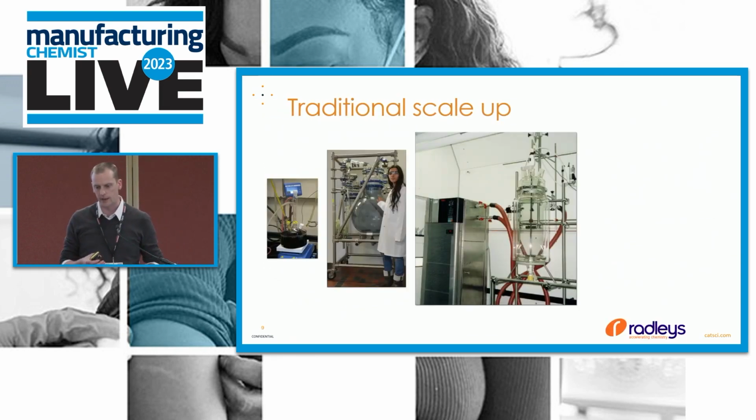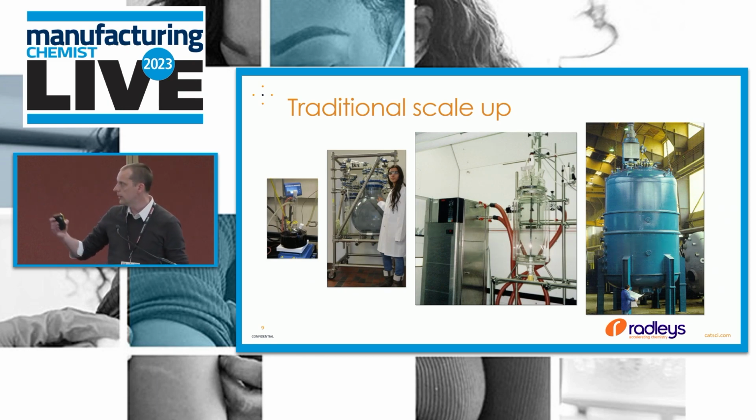So here's a traditional scale-up. You'll start probably before the image on the left-hand side, even with 96 well plates or something for screening reactions, move up into a few hundred milliliters. You might have a way of scaling between that lab scale to a large lab scale for speed. So there's a giant round bottom flask shown here. But more typically, we're moving into process-relevant vessels, such as that one in the middle, from, say, 250 mils up to 50 litres or something, or 100 litres even could be in glass like that, through to manufacturing vessels shown on the right-hand side.